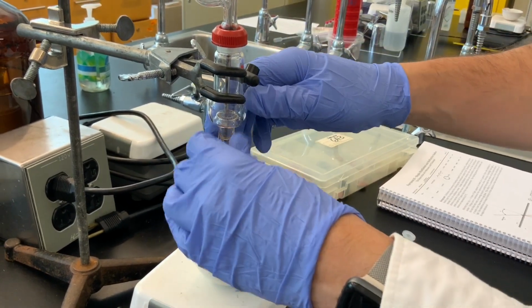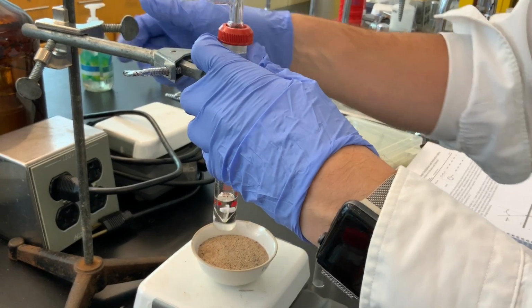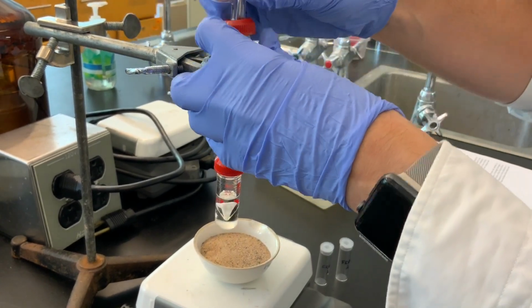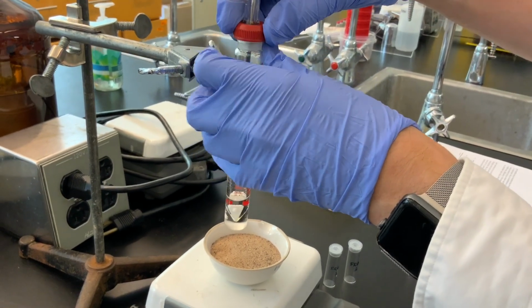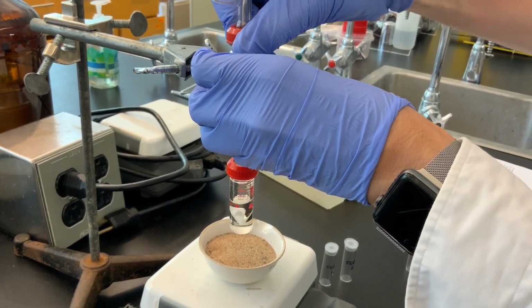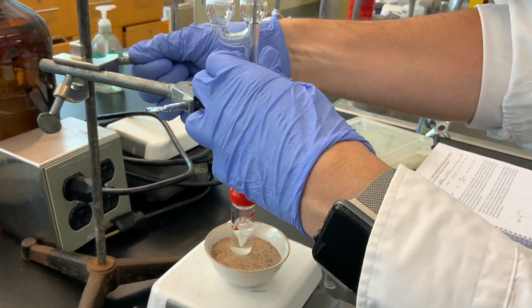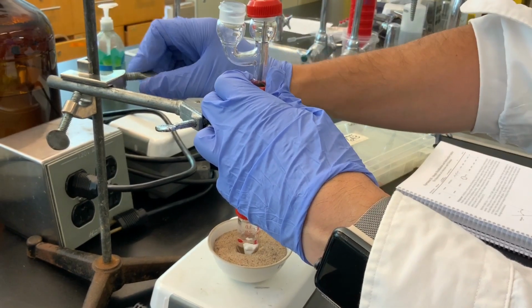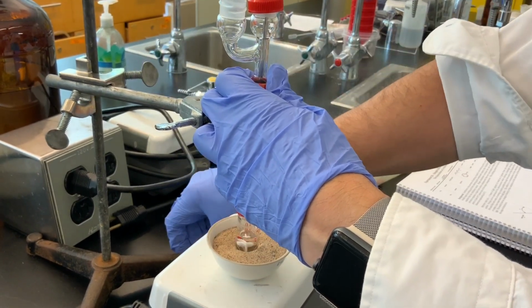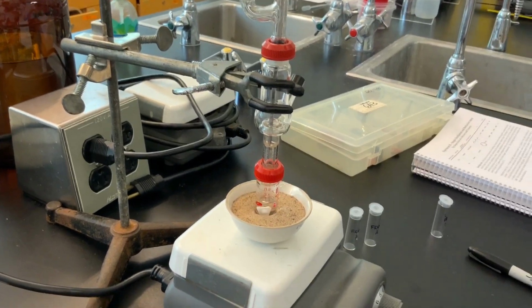All right, so now I'm going to be sure everything's centered, perpendicular to the lab bench. There's something wrong with this here. It might be the screw cap. Oh, there we go. All right, so plunging into the sand here, and so now we're on our way to glory.